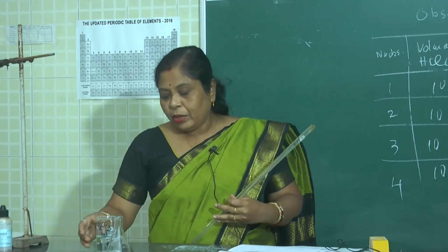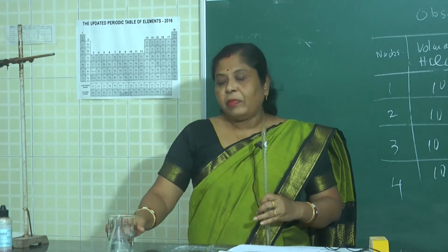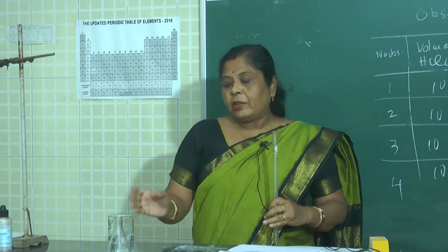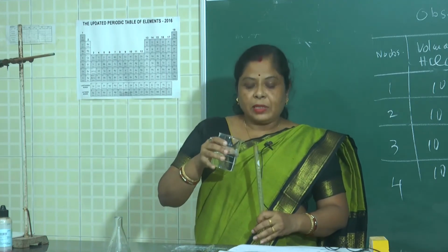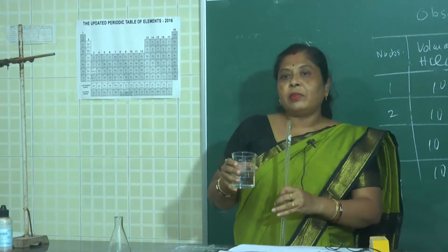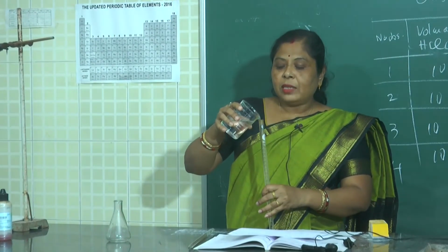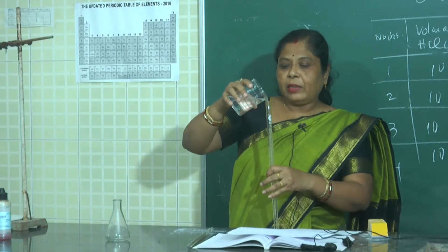Here we are going to take Na2CO3 in the burette. The way I have already told you in the previous video, you have to first rinse it, then fill the burette and fix it. Now as the burette is dry, I will not rinse it. If it is a wet one, you can rinse it. Because the burette is dry, we can just take the final solution.